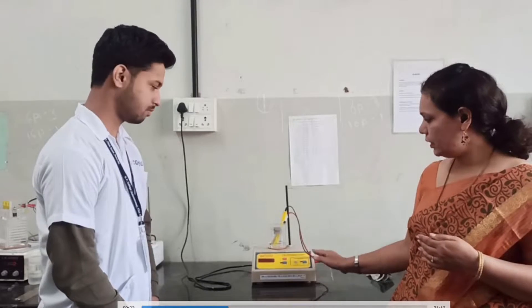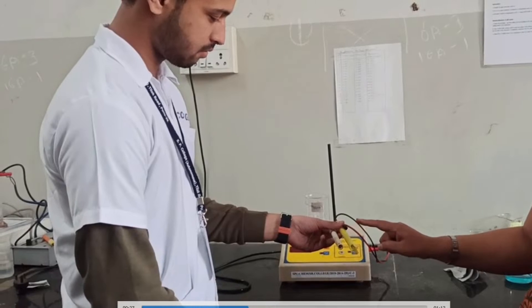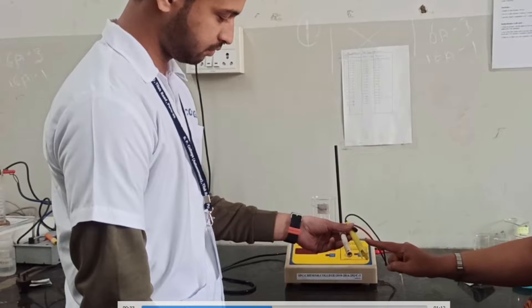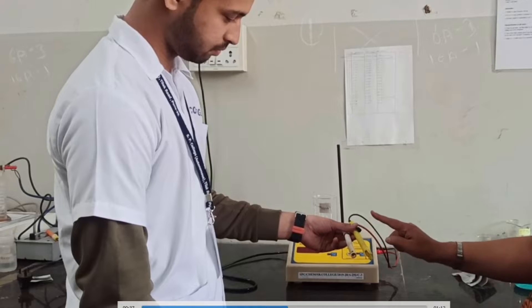We are going to utilize two cells over here. One is a platinum electrode and another is a calomel electrode. These two are external electrodes we are utilizing to measure the EMF.